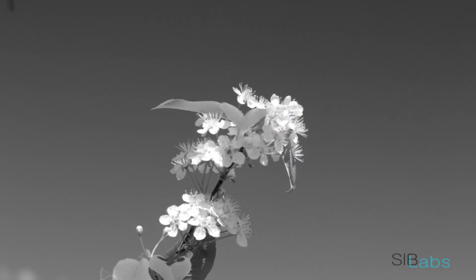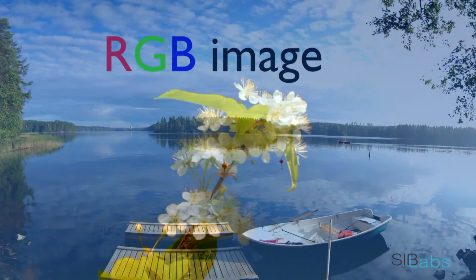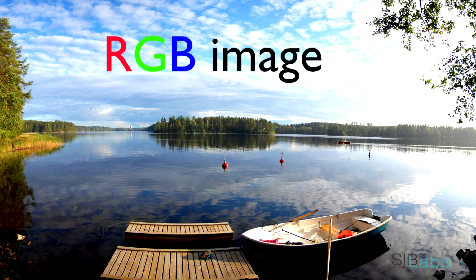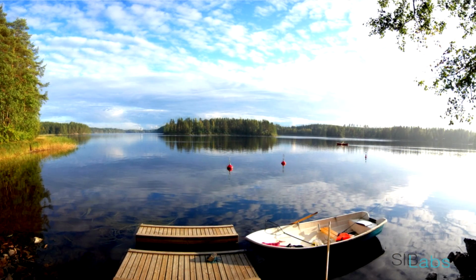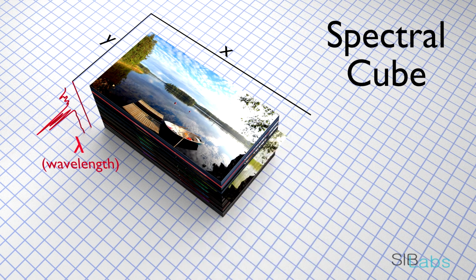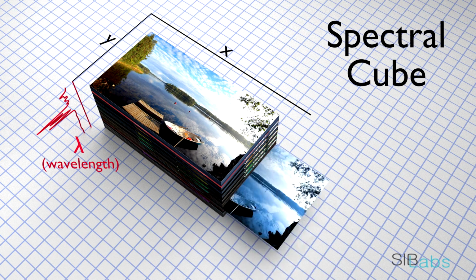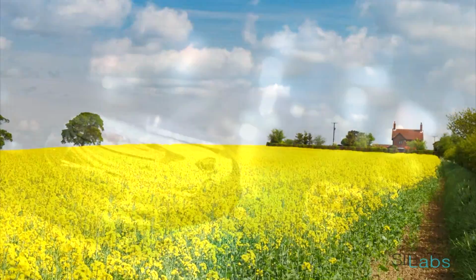The optimal way to get color information for your object is to get the full spectrum for each individual spatial pixel in your image. This is called the spectral image. In the case of RGB image, you have 3 layers of an image where each layer represents one of the primary colors. In case of spectral imaging, you have much more layers, which result in a 3-dimensional spectral image called a spectral cube. In this cube, the x and y axis are spatial coordinates defining the location of a pixel in an image, while the z-axis contains color information representing spectrum of each individual pixel.